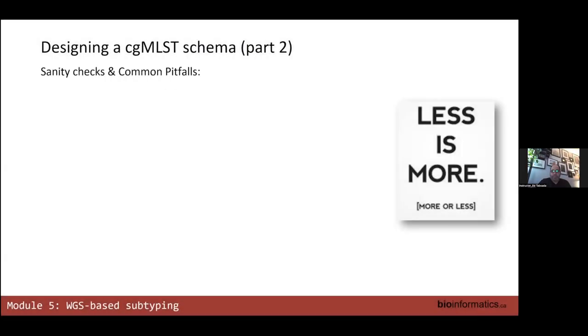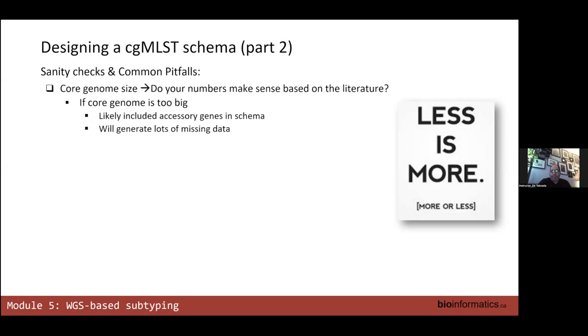But there are still things that you need to do when you look at data. Now, if you use Trubaca, a lot of these things are no longer something to worry about. But certainly before Trubaca, if you were trying to do this by hand, trying to define a core is actually more problematic than people think, because you have a data set, and you're trying to define the core from that. Great, why don't I just choose the genes that have complete data across all the genomes? You could tell yourself. And then I would tell you, well, how do you know that you don't have some crap genomes in your data set, and that is driving down the number of core genes that you are identifying?